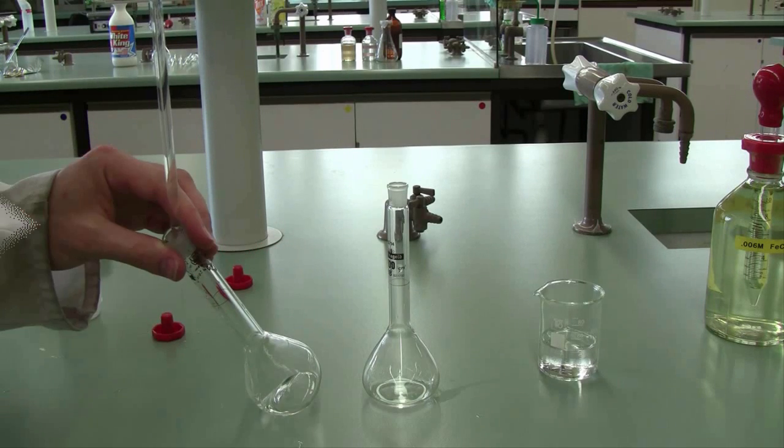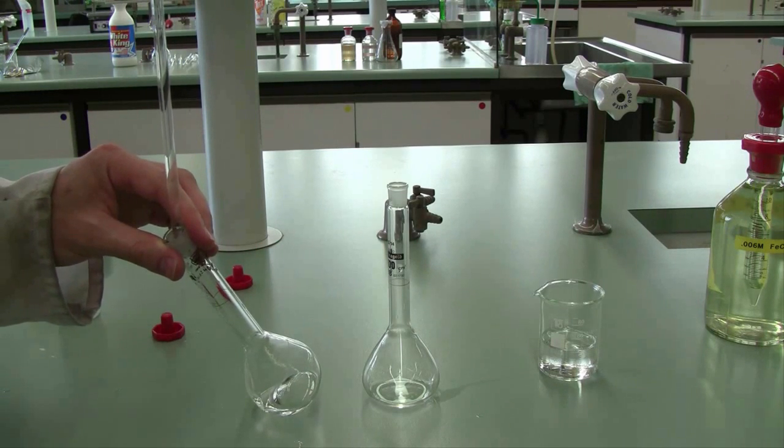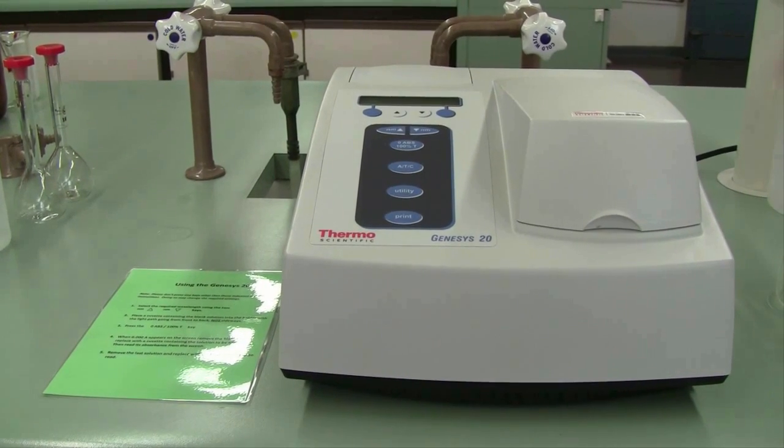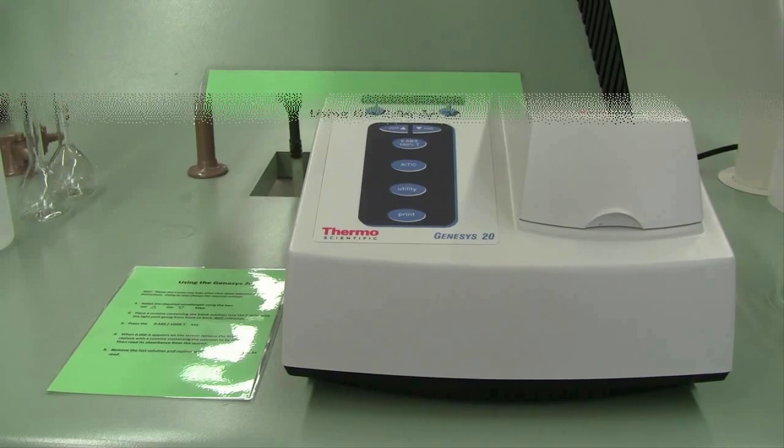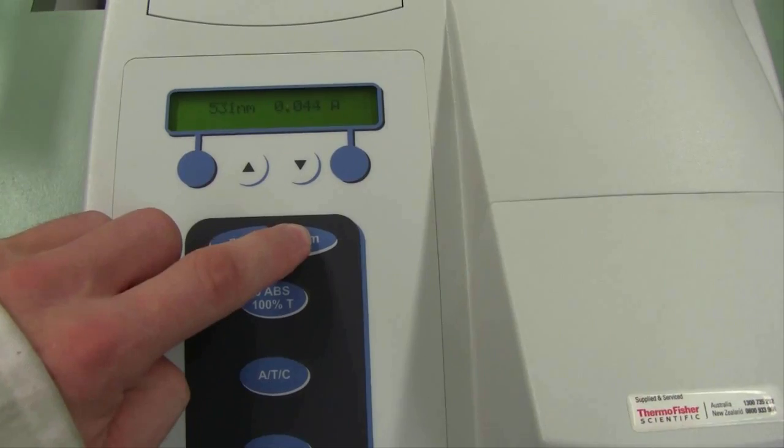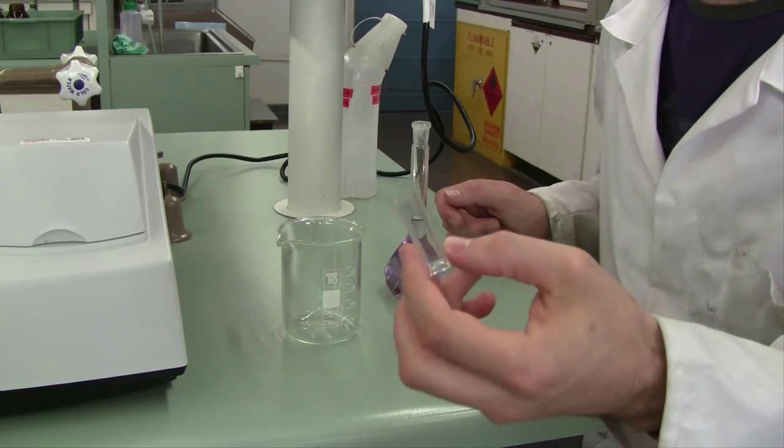Once all of your solutions are prepared, it's time to go to the UV-visible spectrophotometer to measure the absorbance of your samples. An instruction sheet is provided. Begin by adjusting the wavelength of your instrument. The first sample you'll need to measure is the blank, and then go from lowest concentration to highest concentration.